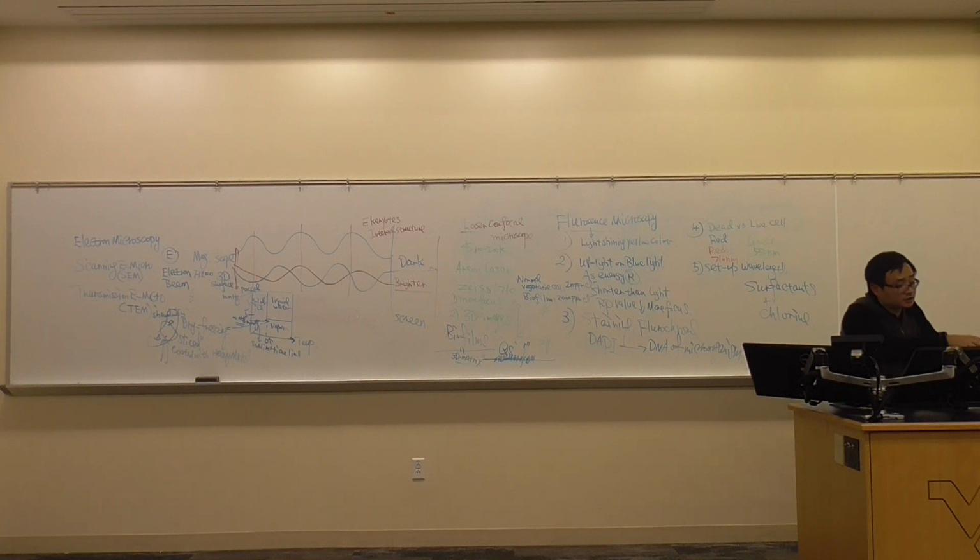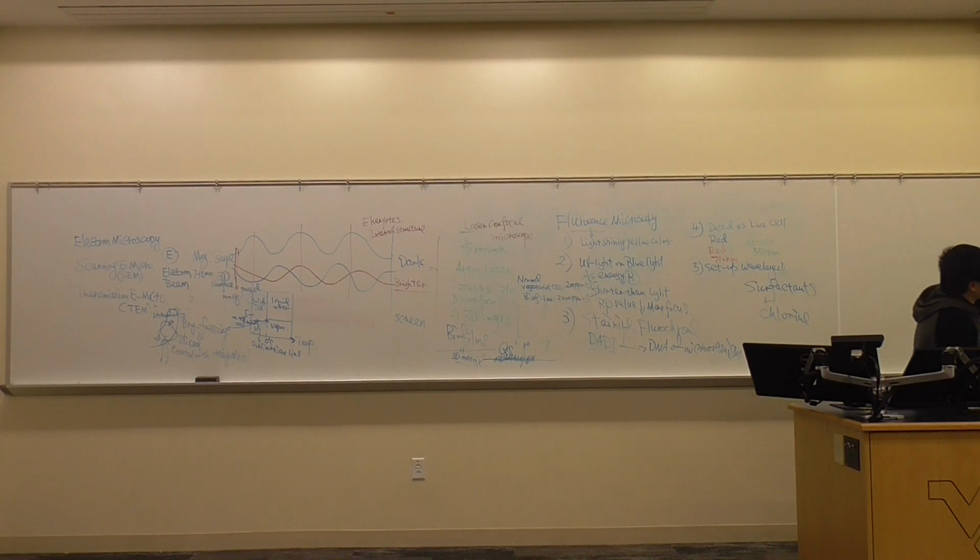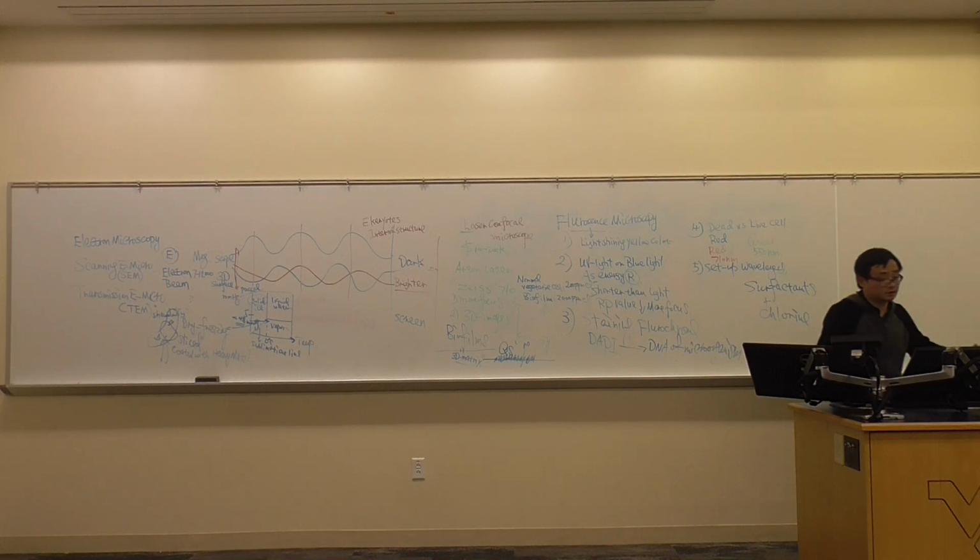We're going to talk about the chemicals behind it, what's the story behind it, later on. Can you see what happened with the increasing concentration? The roughness is decreased. At the end, you didn't see any of the morphology. It looks like they screw together because they're getting killed.